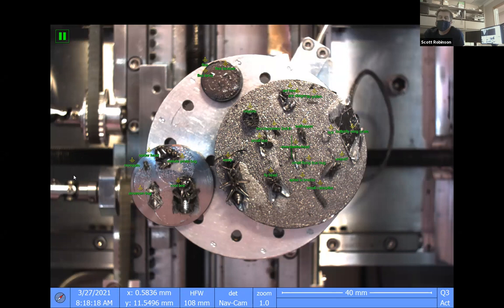And what we do is we set it up so that people have presets that they can go to, so they're already focused. People can go to those places, drive the electron microscope from their classroom, and they could do it from their classroom anywhere in the world.